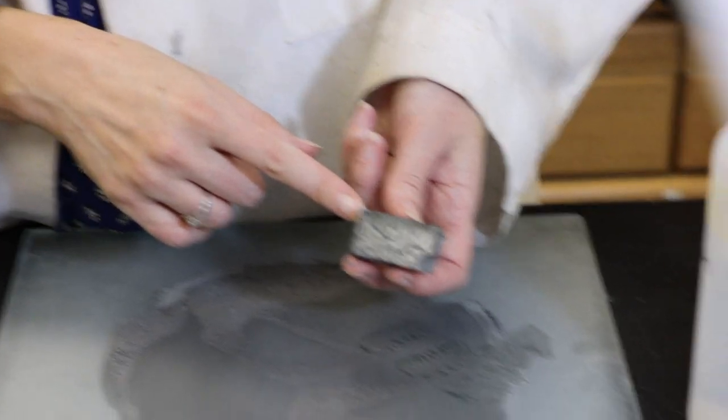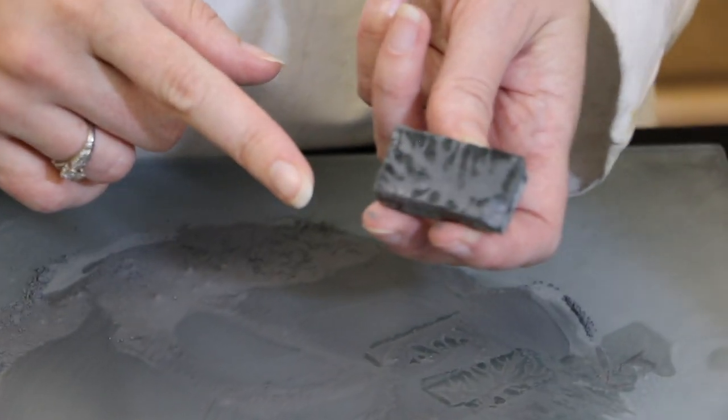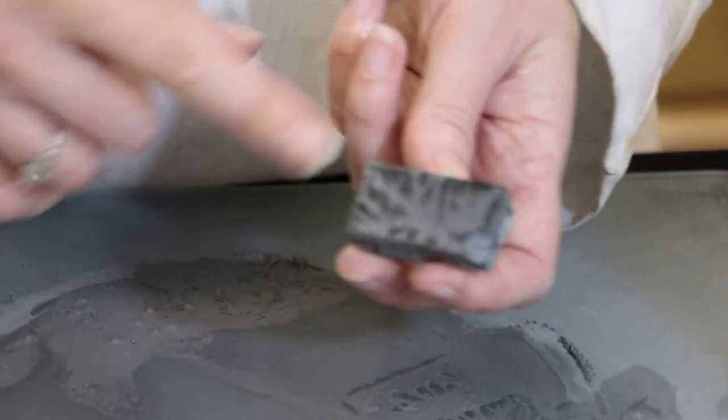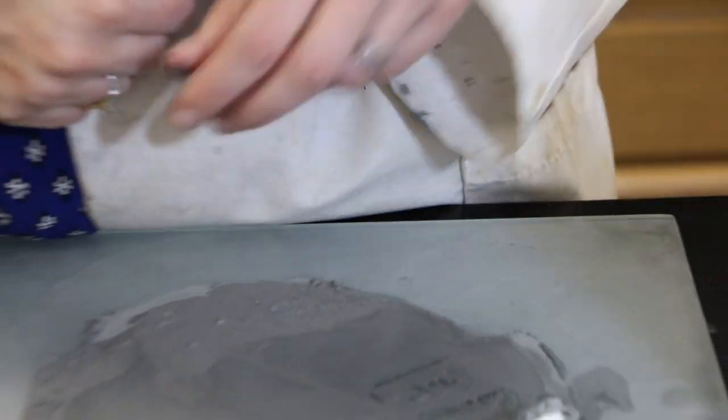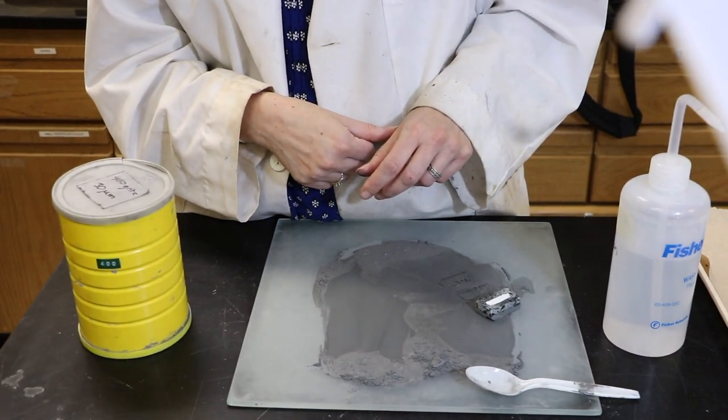For thin sections, if you go down to 9 micrometers polishing grit and have a nice shiny surface, you're good to go. That's just some guidelines on how to polish on a glass slide.